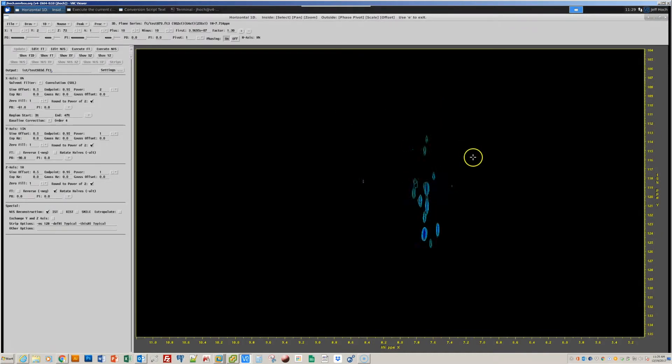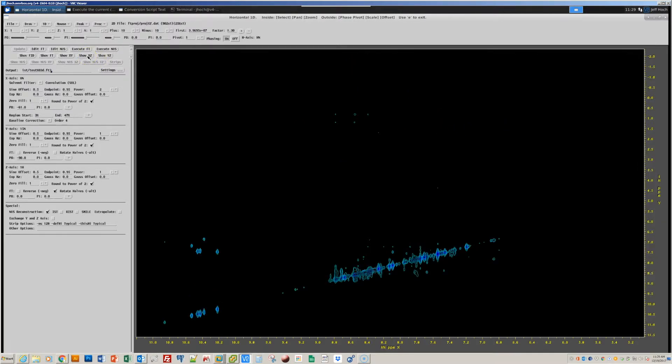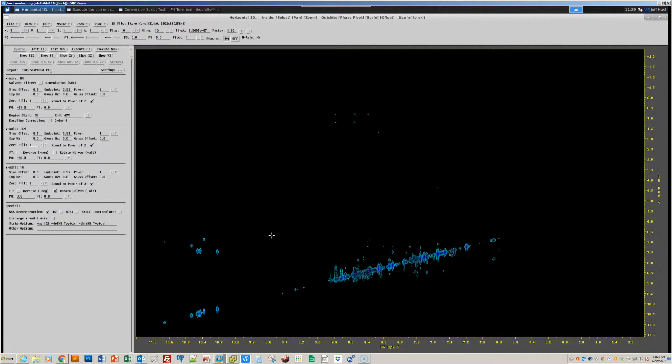So, here's the spectral data. Here's the XY projection, which looks great. Here's the XZ projection, which also looks really good. So, now that we've set both the phase correction options and Fourier transform options for all other dimensions, we're ready to do a complete non-uniform sampling reconstruction.